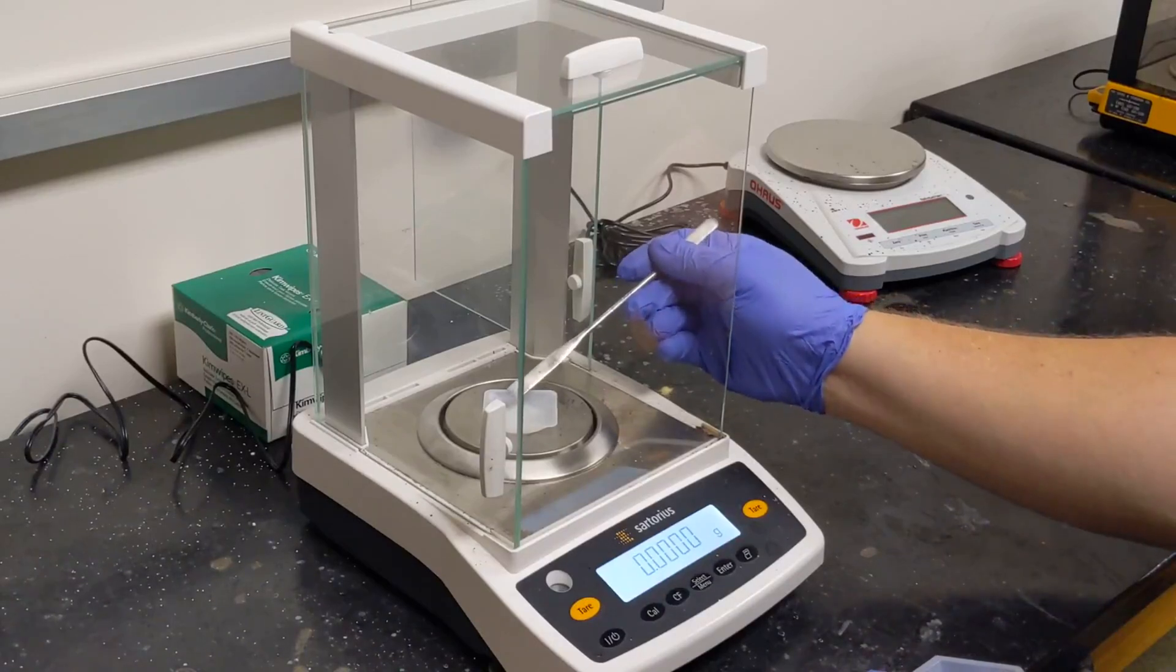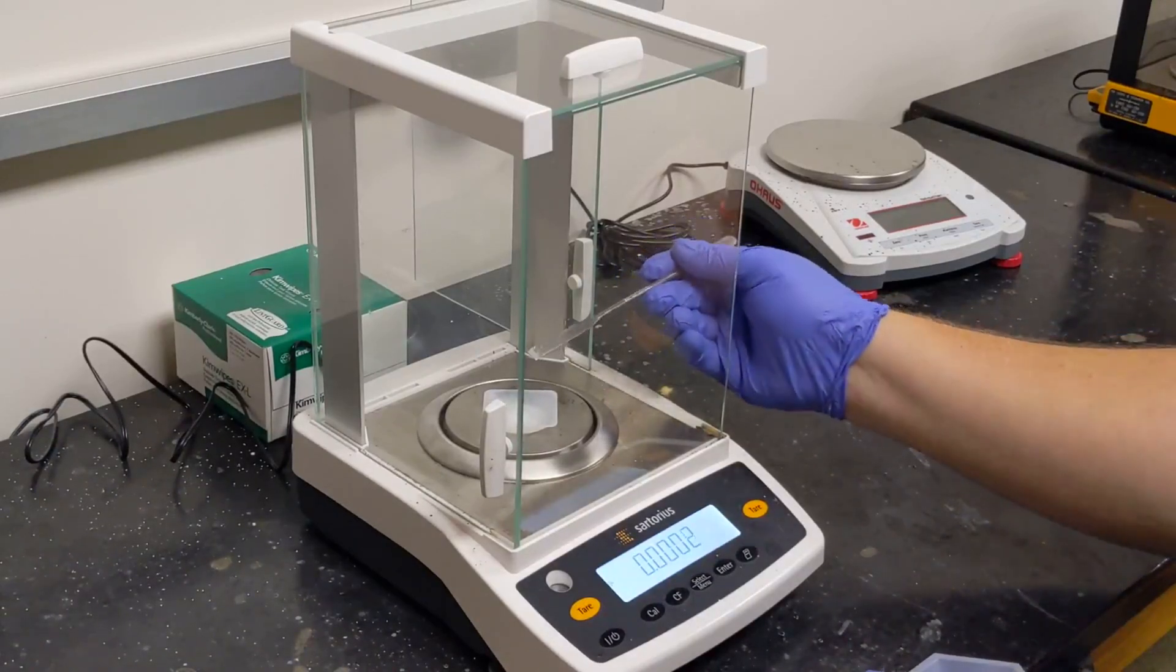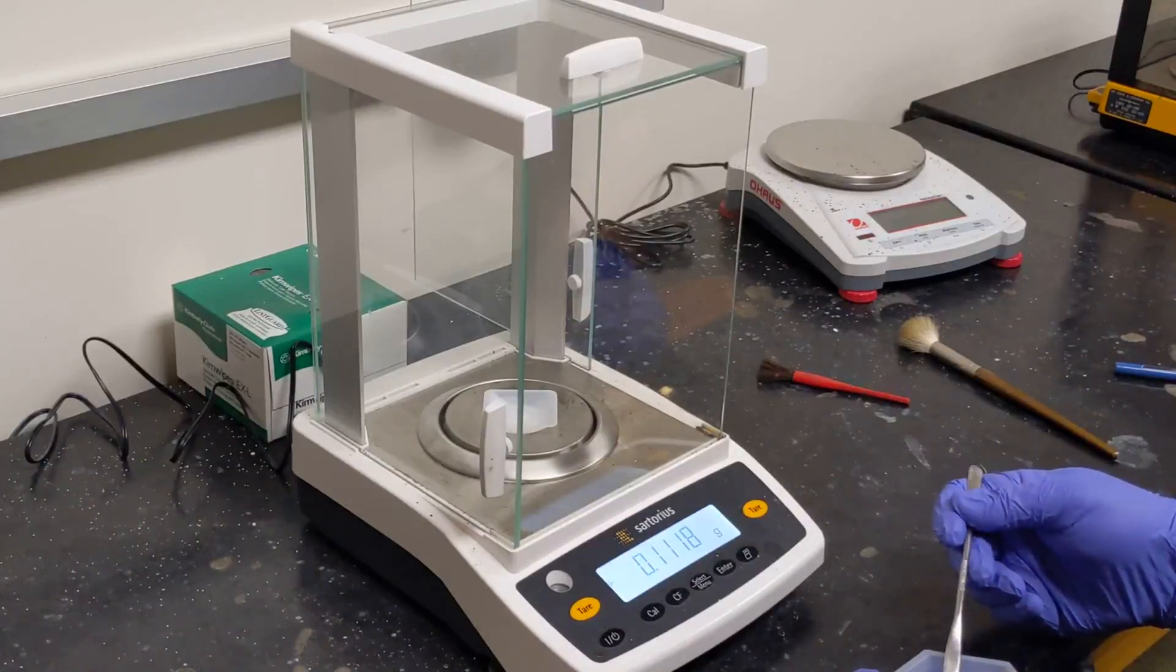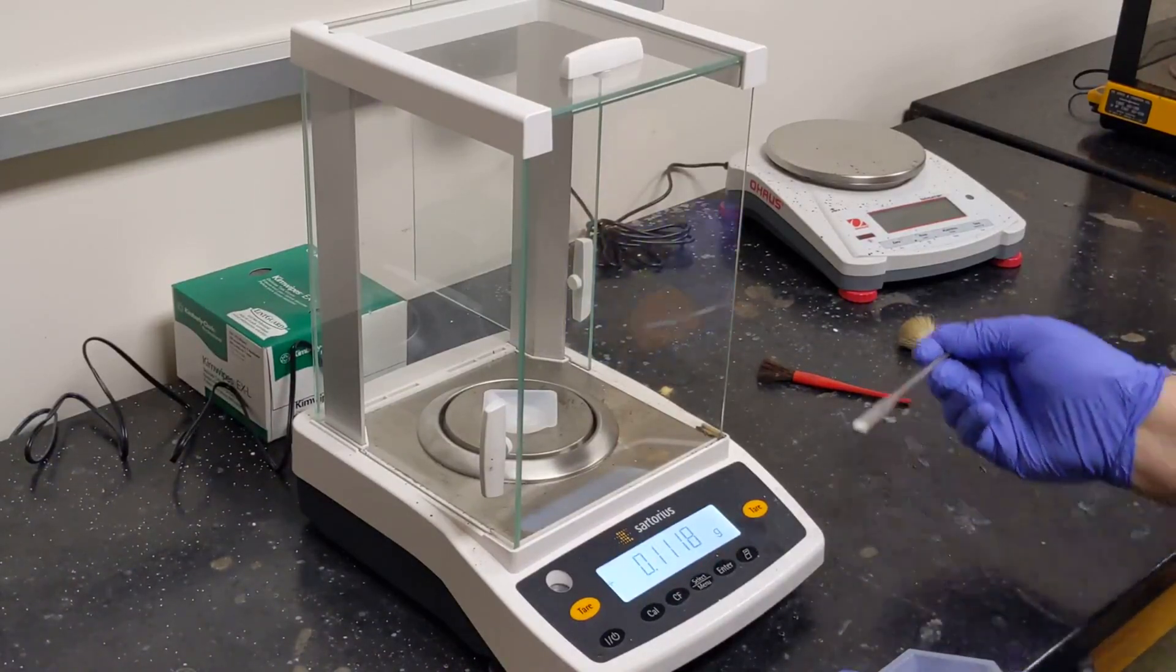You may have to tap the spatula in order to get it off the end. That's perfectly fine. We'll repeat this process until we have the amount of material on the weighboat that we need for our particular procedure.